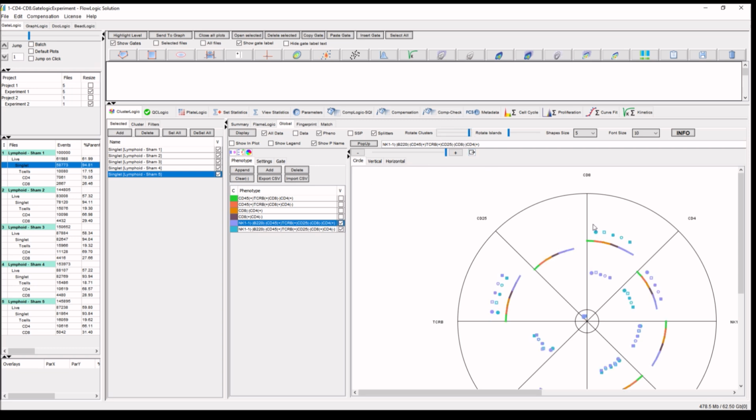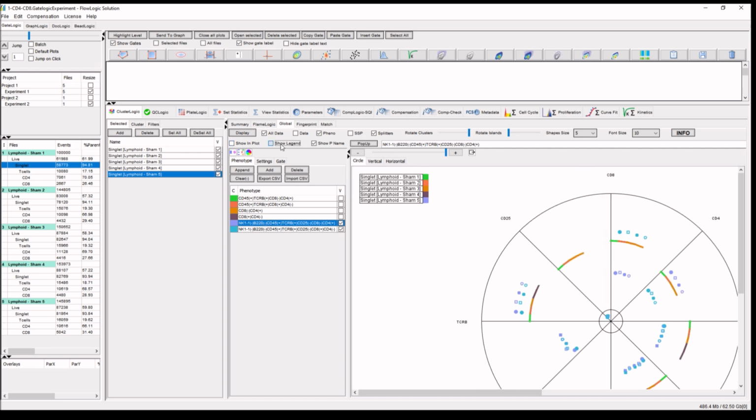When we do the rotation, our data is displayed, and if we display just one phenotype, the phenotype is marked with the color of the data set that we selected. If you use two, on the screen we will see the color that we have for different phenotypes, otherwise we will not be able to understand which is which.